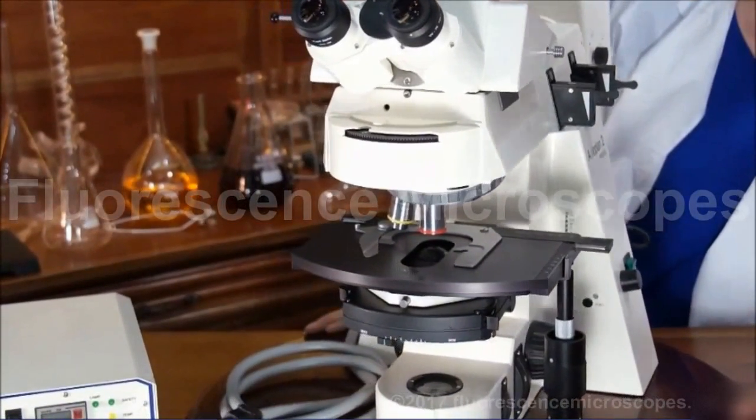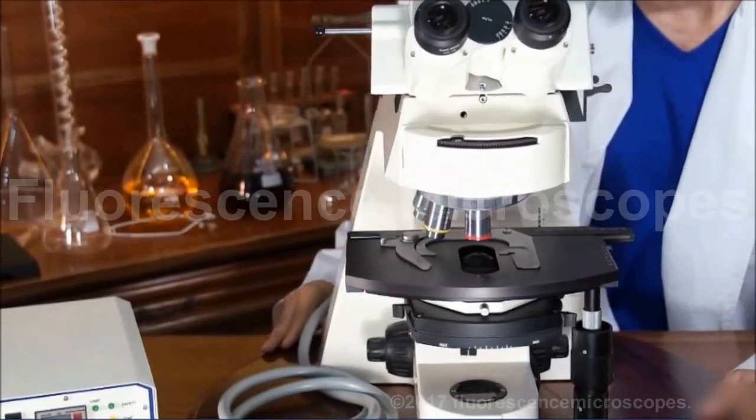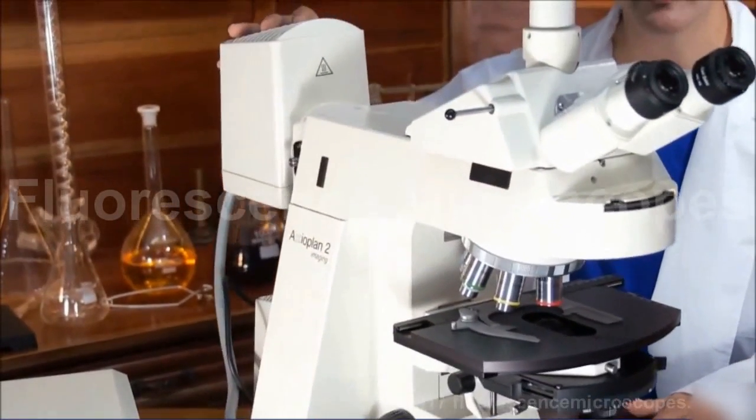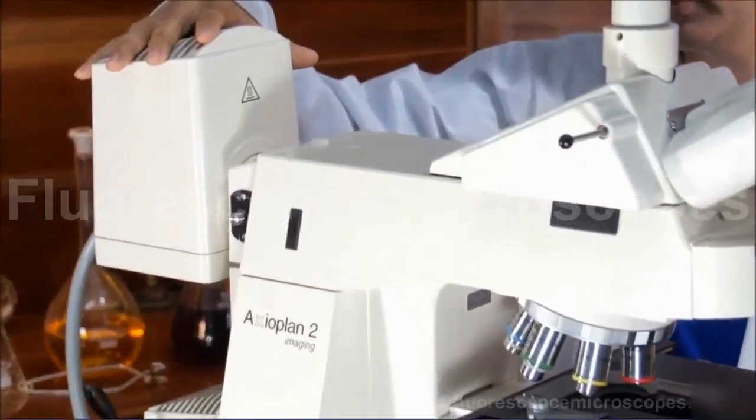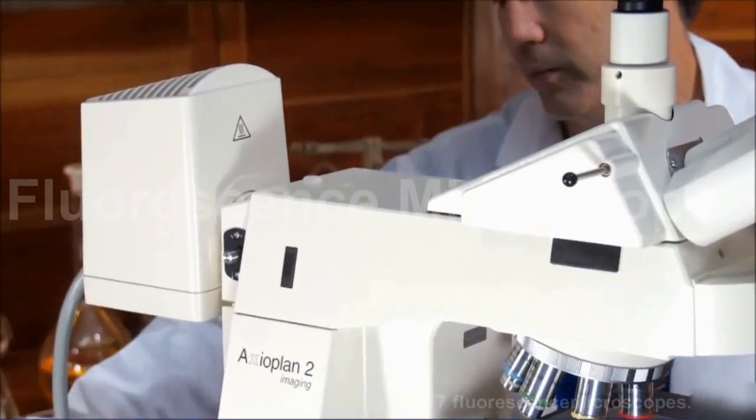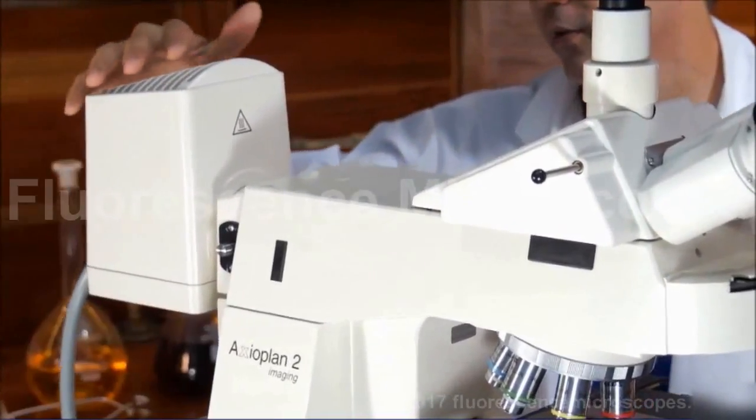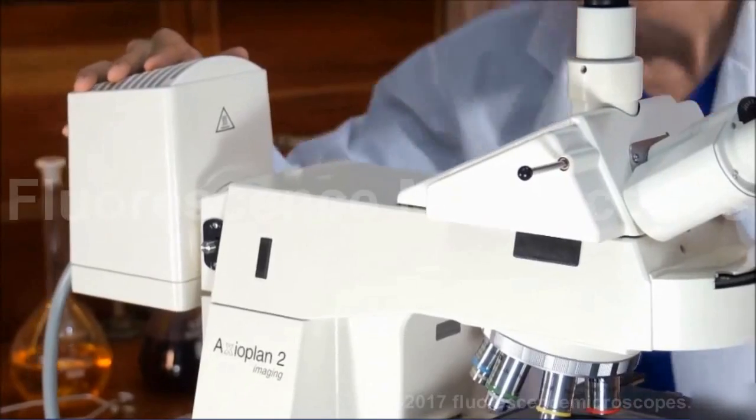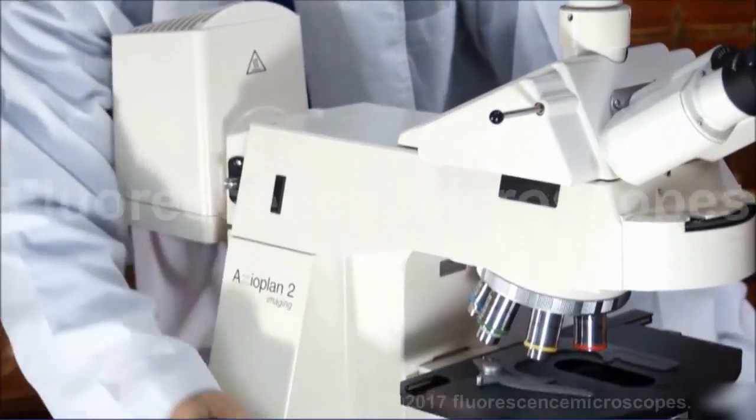We've configured this particular microscope with an HPO100 mercury illumination system. Here's the power box for it, here's the lamp housing, and they're connected by this cord.